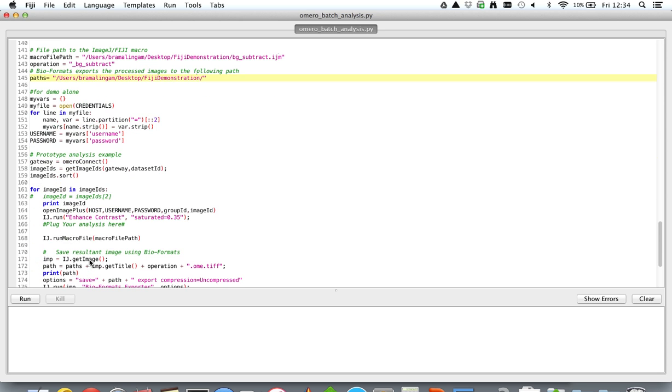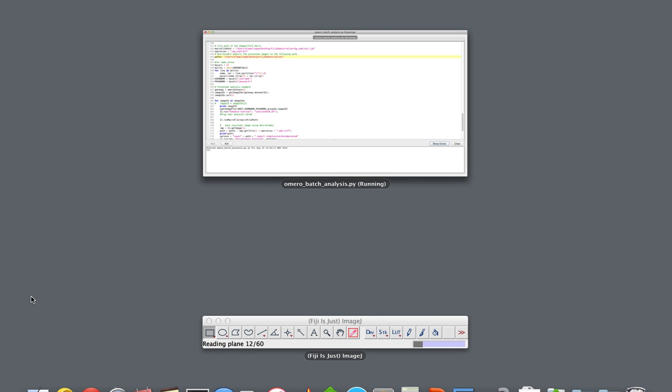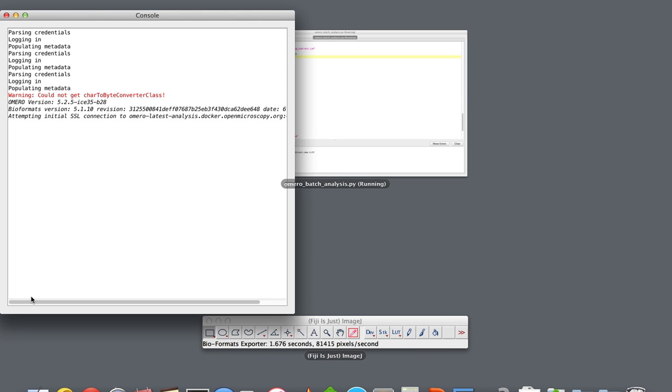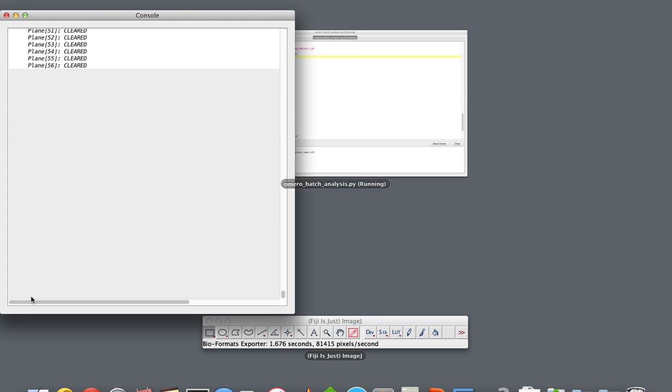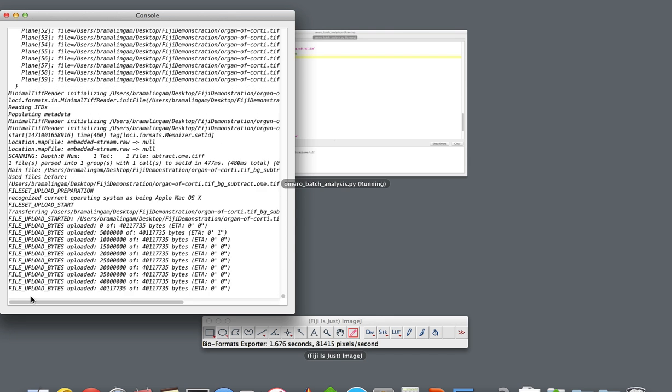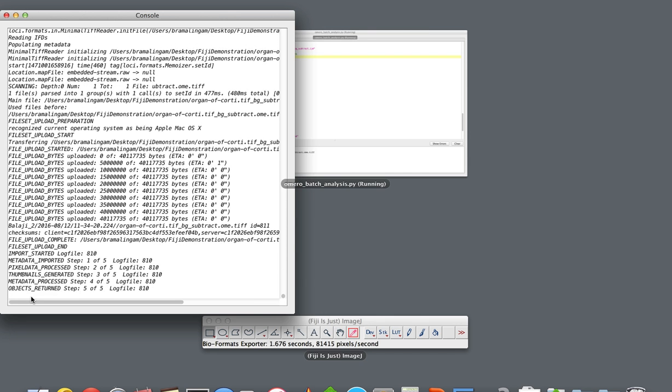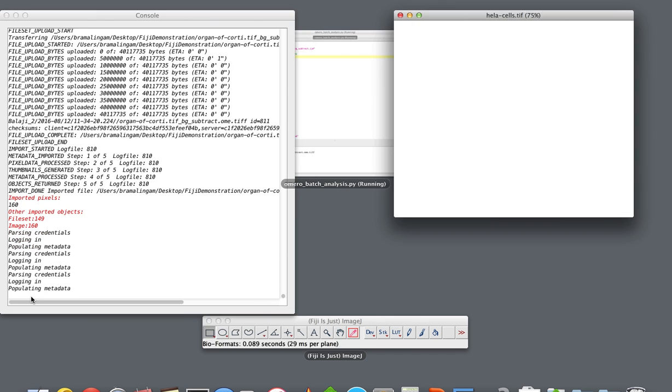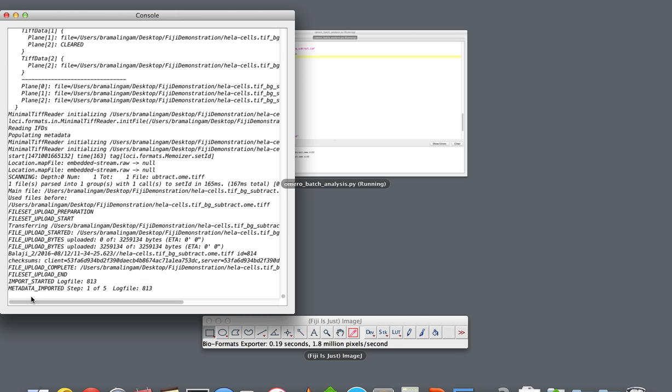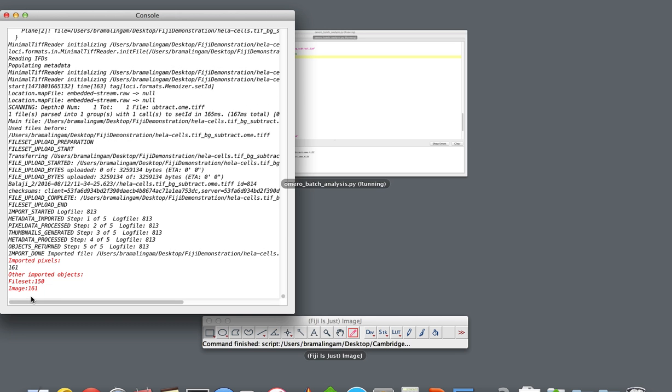Now we're good to run the script. What this basically does is opens up the images iteratively, does the background subtraction, and then pushes the images into OMERO, and this does it for both the images under the dataset.